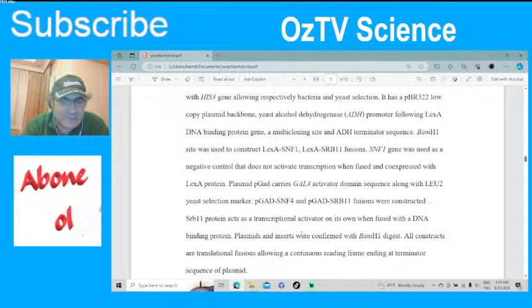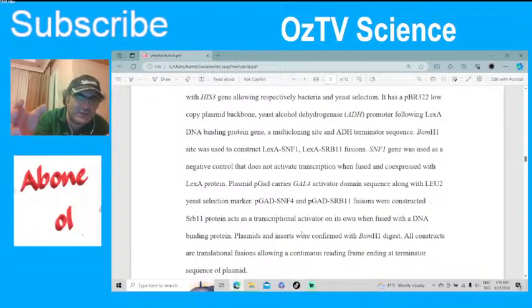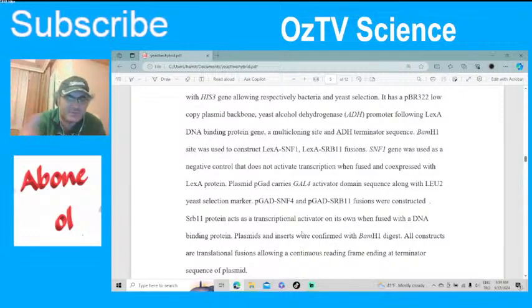SNF1 was used as a negative control that doesn't activate transcription when fused and co-expressed with the LexA protein. So this hybrid doesn't do anything. When you combine LexA and SNF1 protein, which is a yeast protein, in this experiment we are trying to understand the relation between SNF1 and SNF4. So in the plasmid you will see another construct with SNF4. But this combination alone doesn't do anything. That's why it's a negative control. So it doesn't activate transcription.